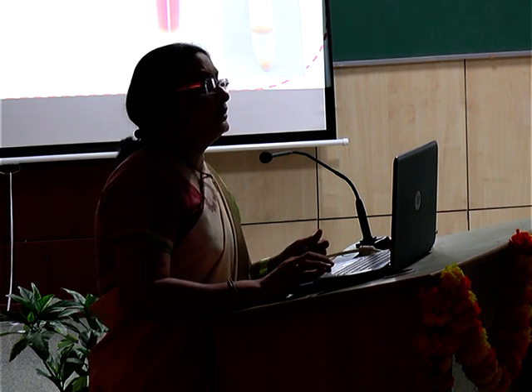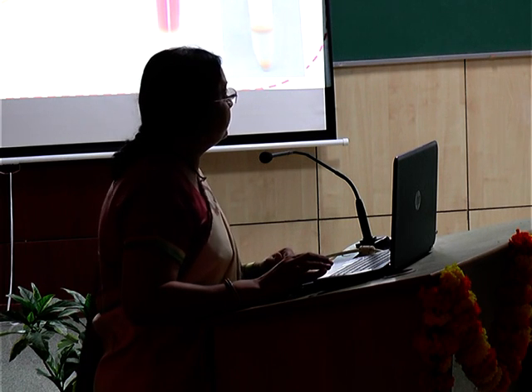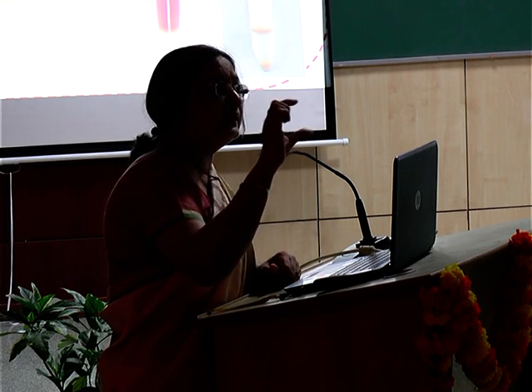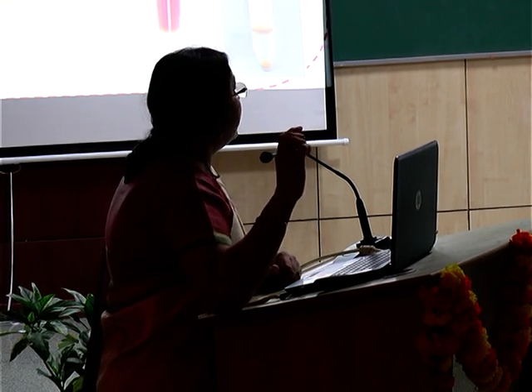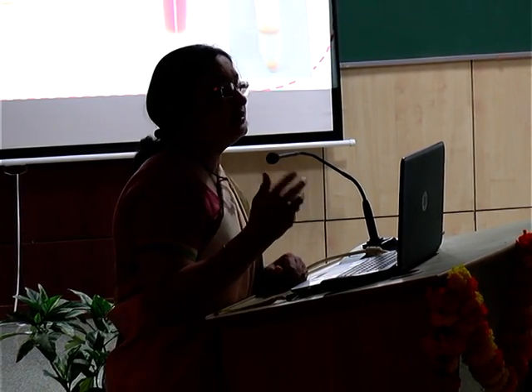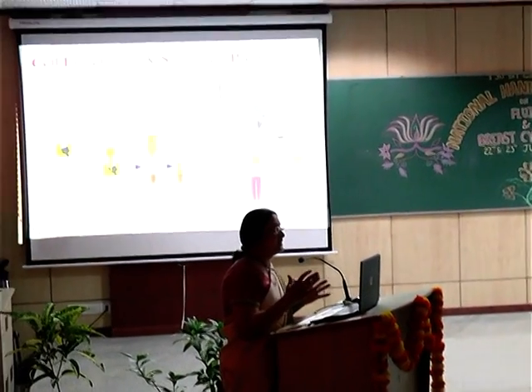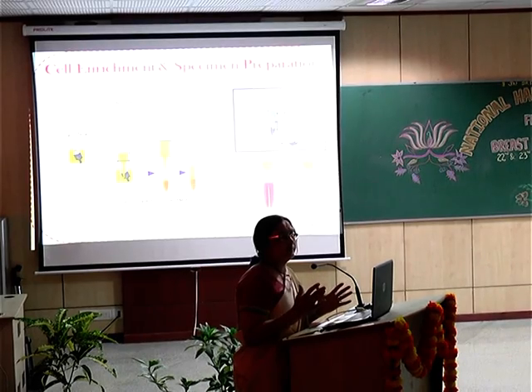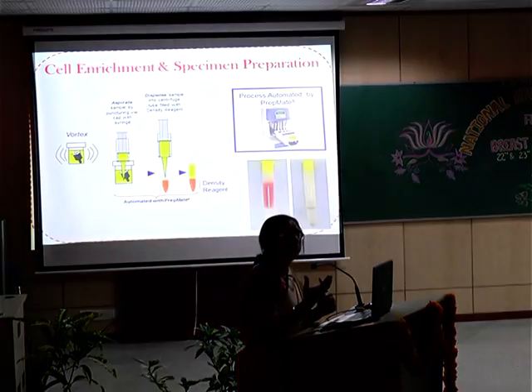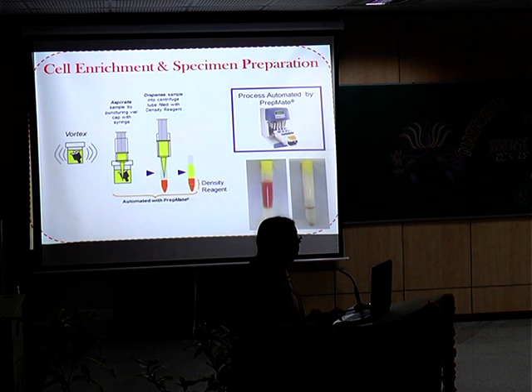Now in this you are seeing a cervical brush. So the pictures are from cervical cytology, but if it is a fluid specimen, you have to add an equal amount of fluid to a vial which already contains a weak fixative. Once the vial is in your laboratory, it is vortexed so that the randomly joined material is separated out: the inflammatory cells and the mucoid material are separated from each other. Loosely adhered cells are also separated, but the true clusters still remain together, which you can see in the subsequent preparations.